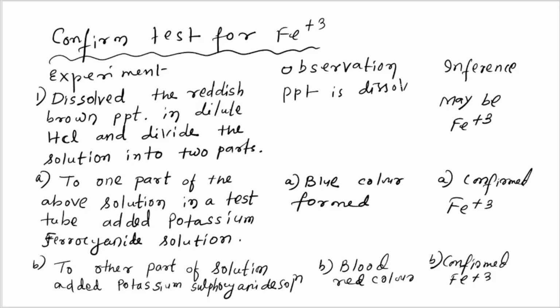in dilute HCl. Then you should observe what is the color. This is dissolved. That means here the solution is divided into 2 parts. To one part add what solution?